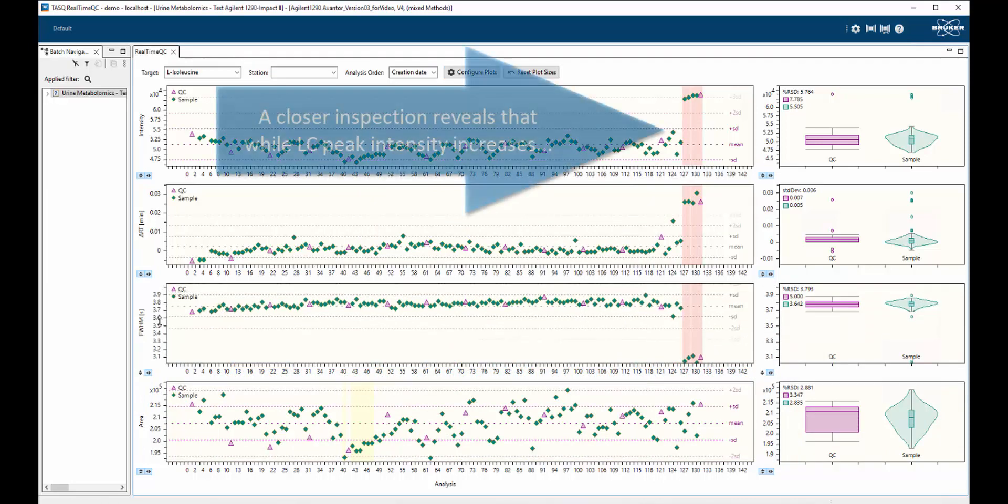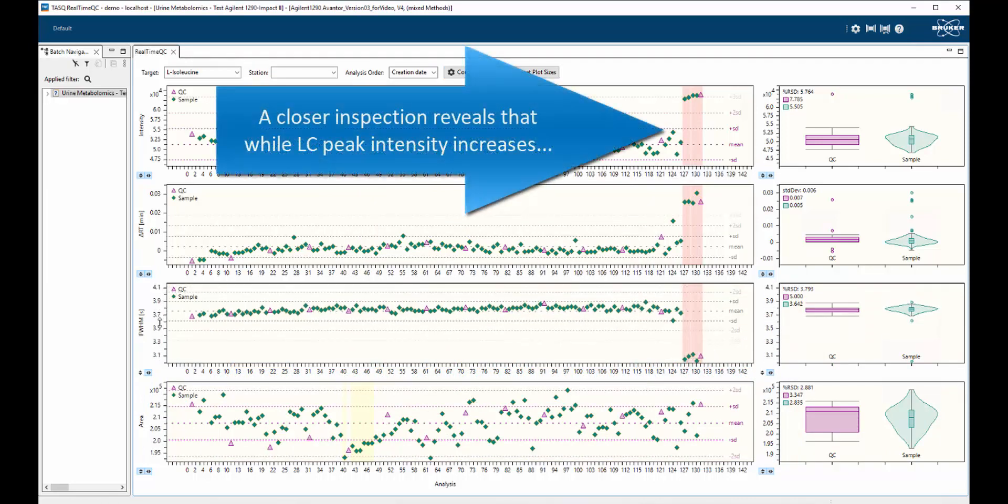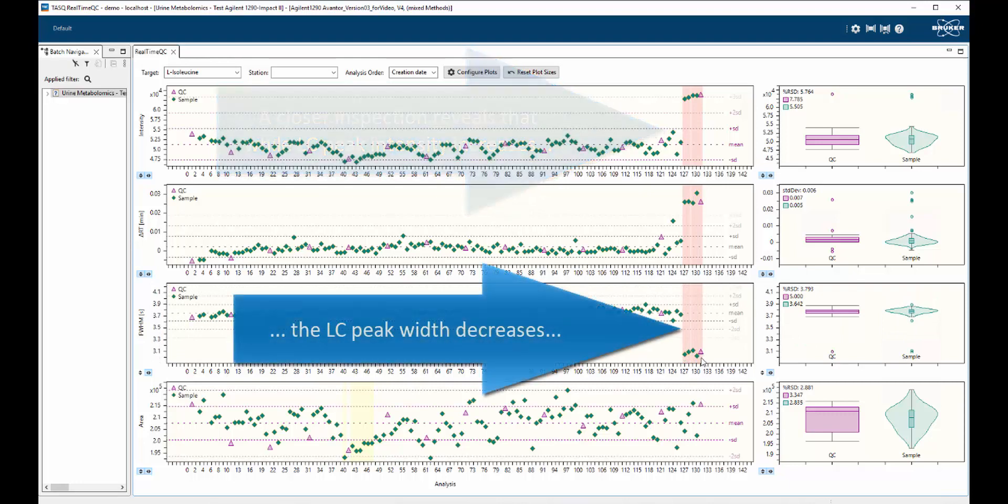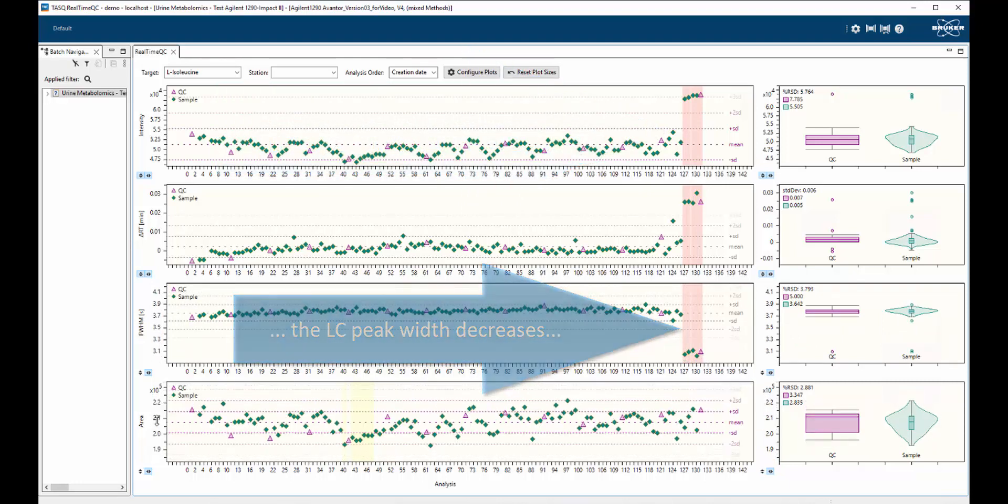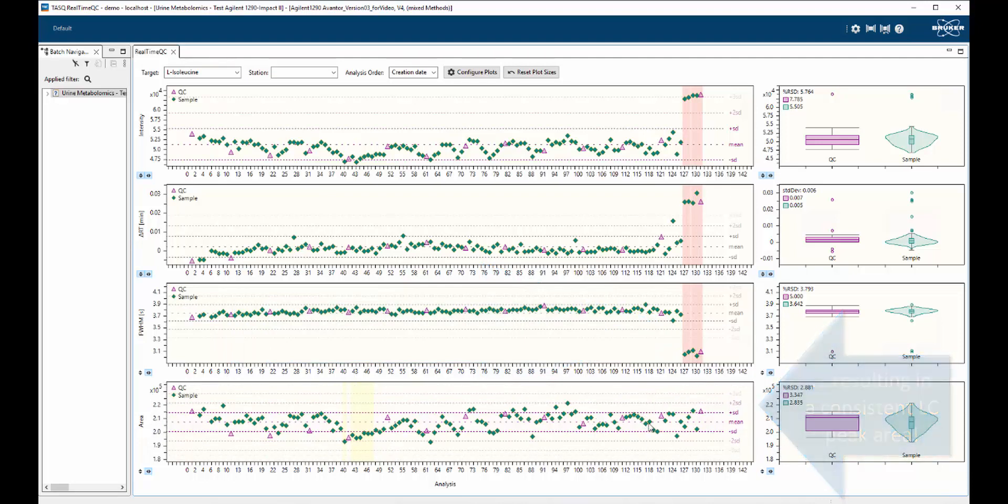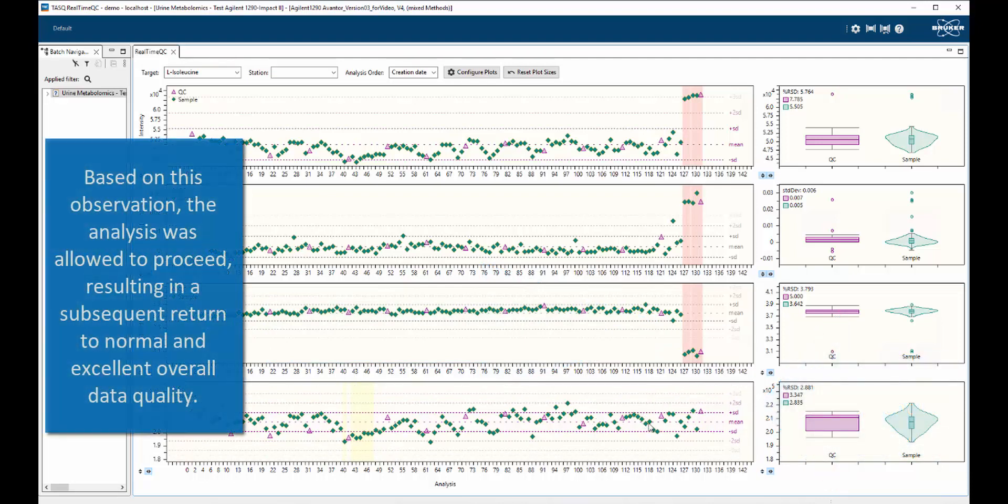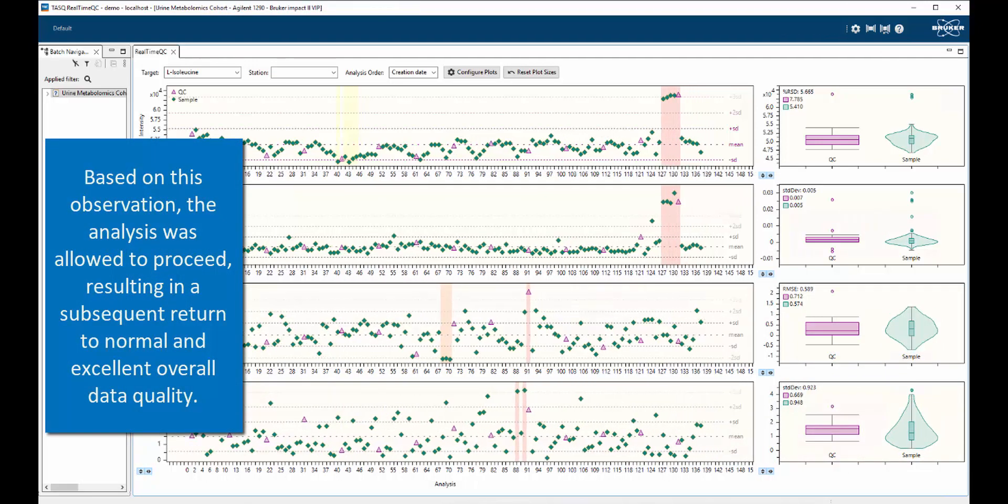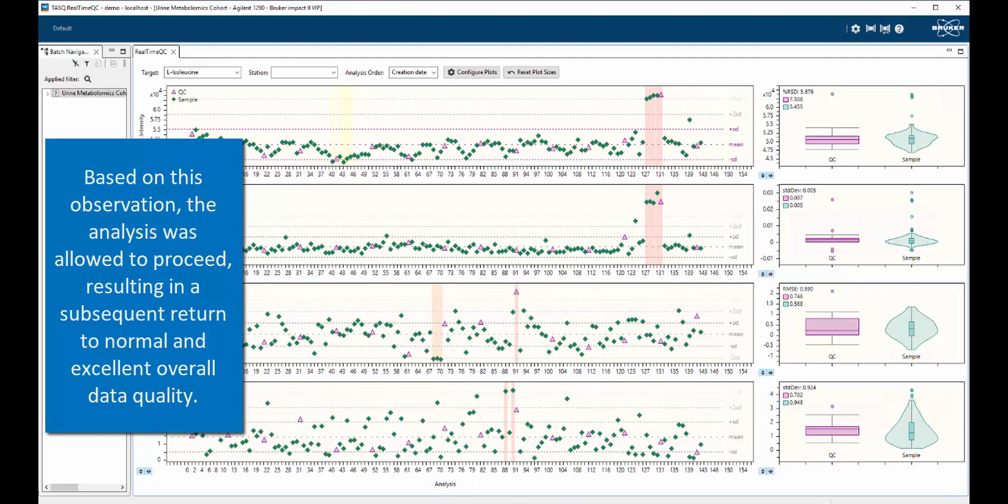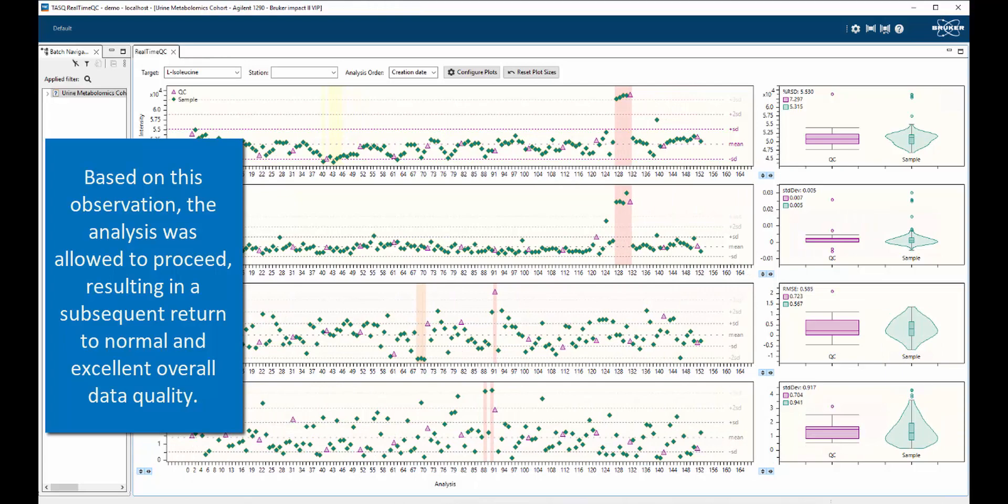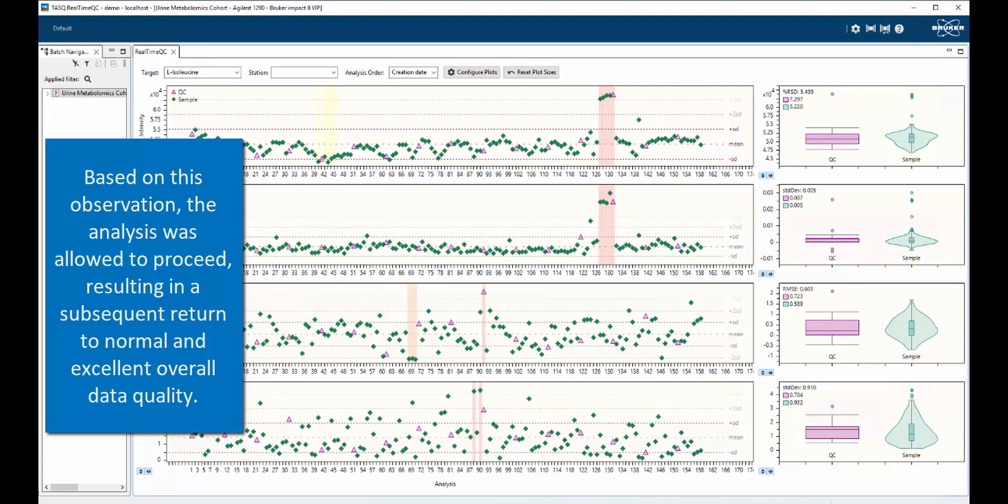However, a closer inspection of additional data shows that while the LC peak shape is changing, the LC peak area is remaining absolutely consistent. Therefore, the analysis is allowed to continue without interruption. Subsequent analyses show that the measurements rapidly return to expected values.